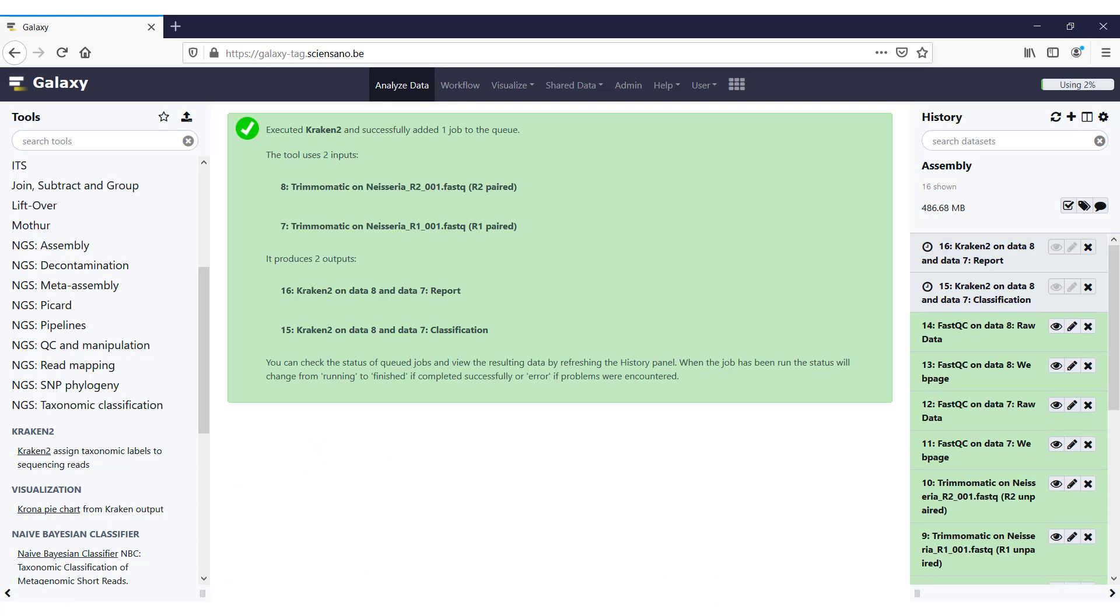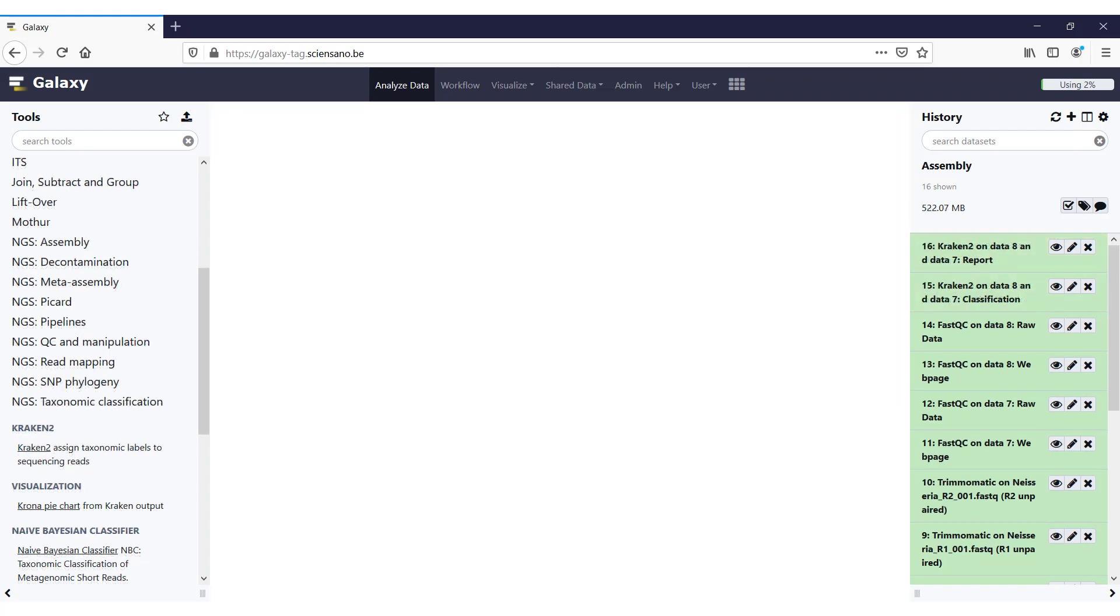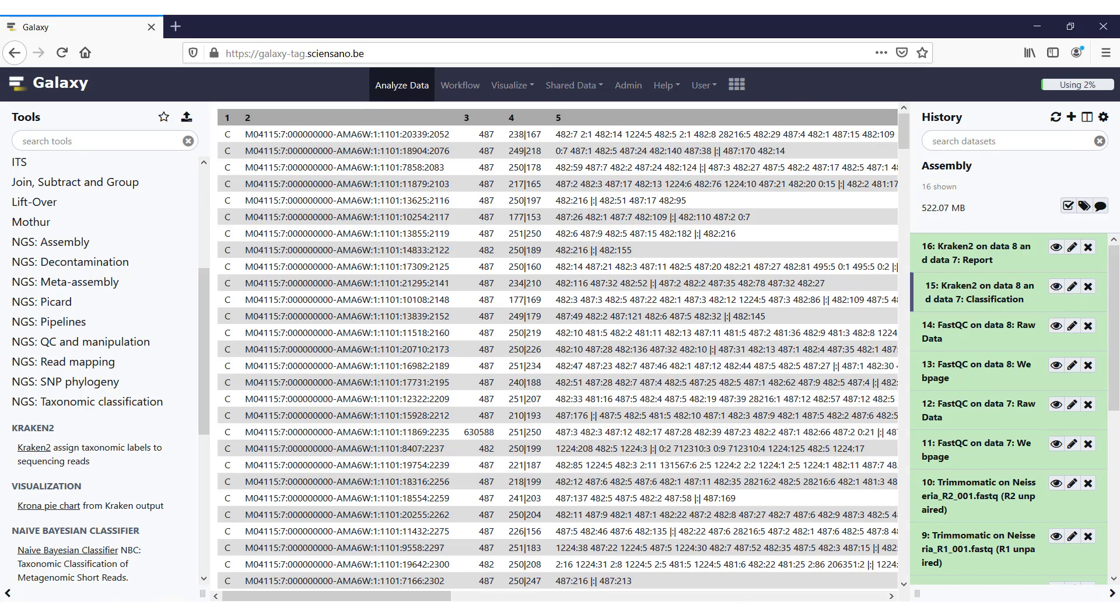So this will run for a while. Once the run has finished, we'll continue. So Kraken has finished running now, and we can have a look at the outputs. The first file we'll look at is the default file that is output by Kraken 2. So we just click on the eye icon, and this screen will open up.